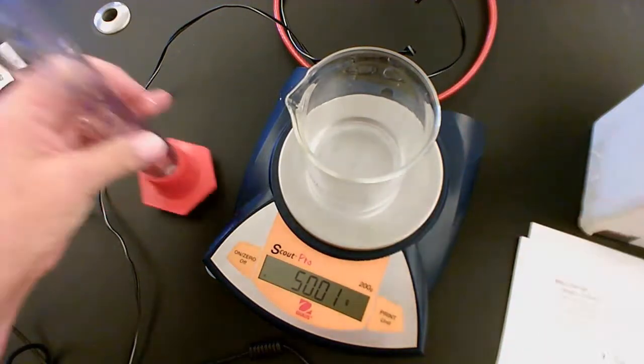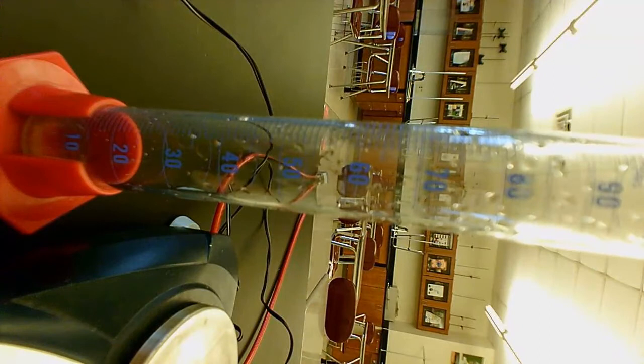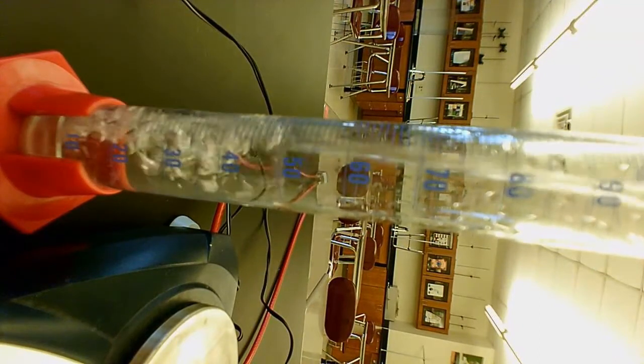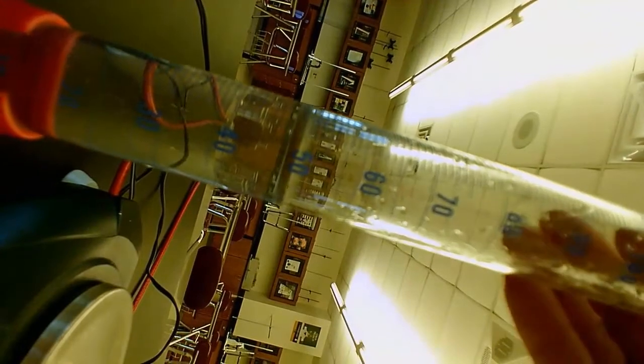So now what I'm going to do is pour, this may be hard to see, I'm pouring my exactly 50 grams of water into my graduated cylinder. But it's going to be hard for you guys to see the reading. So what I'm going to do is get a piece of paper. See if that helps. It does if my camera was upright.